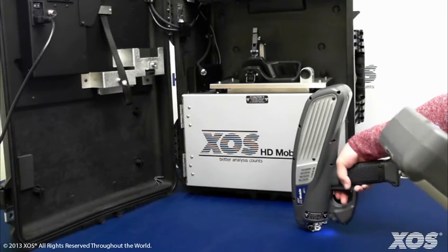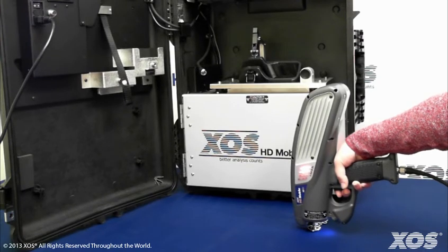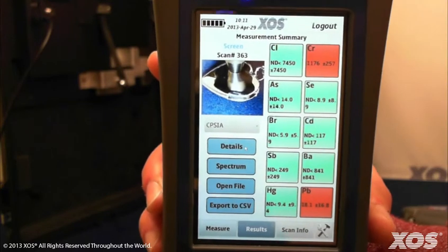For operator safety, a two-button trigger is utilized. The user must press a button on the HIM and then pull the trigger on the gun before the instrument will start to screen. Once you have confirmed the presence of an element you are concerned with, release the gun trigger to finish screening and the color-coded results will appear on the screen as before.